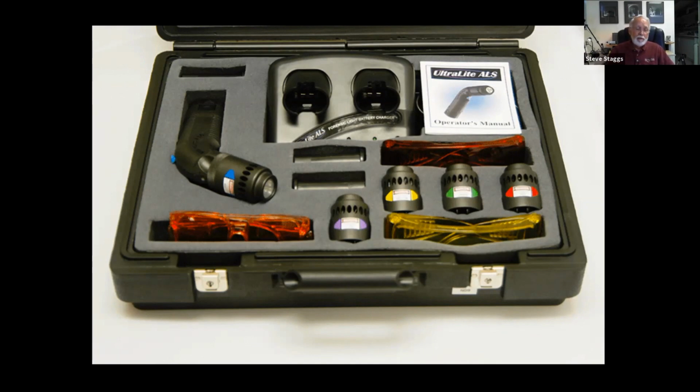We can find body fluids such as semen and saliva and urine. It can help us find bloodstains, but it does something different. It makes them actually look darker instead of glowing. Now, when you have the body fluids, they're actually going to glow, and I'm going to show you some examples. I have a couple of photographs I can show you that do that.